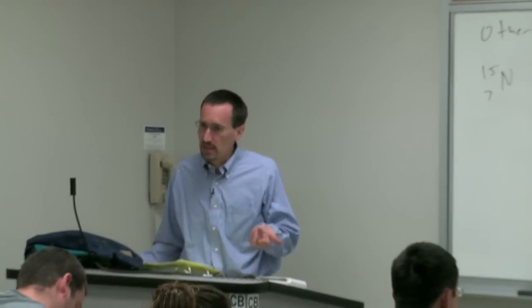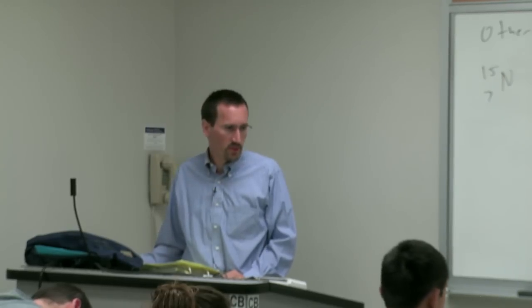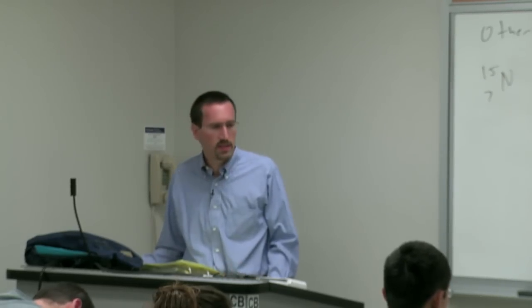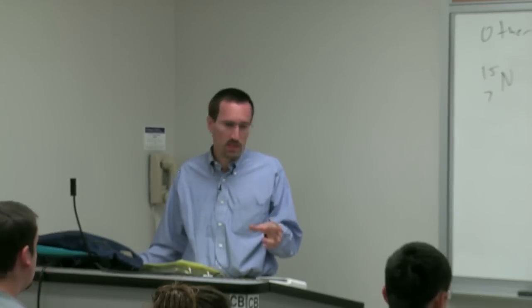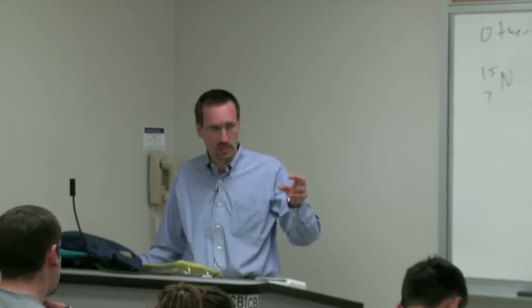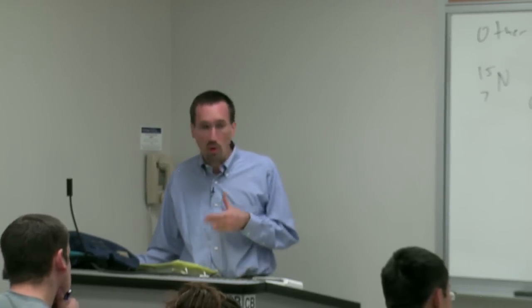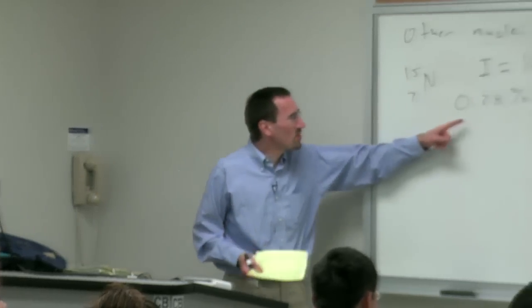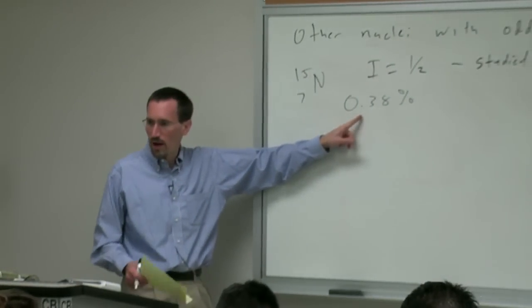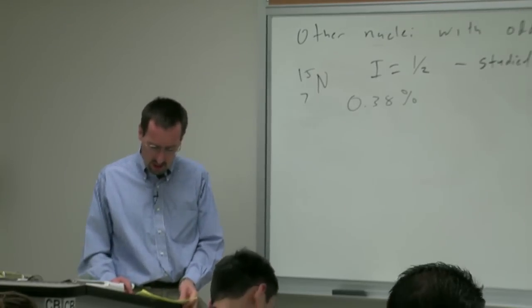Isotopic abundance of C13, spin active, is 1.1%. And you know that carbon NMR is not very sensitive. You need to have a reasonable sample size, more than you have for proton typically, and often collect data for much longer. Well, by the time you're down to 0.38%, studying it at natural abundance is pretty hard.